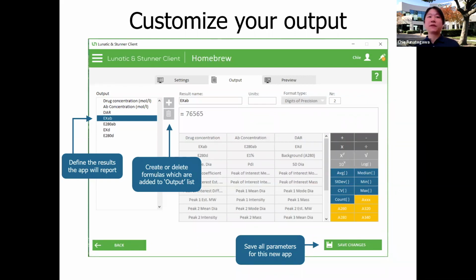So I have the extinction coefficient of the antibody at 280 and at 252. I have also the extinction coefficient of the drug at 252, which is where the absorbance maximum of the drug is, and also the absorbance of the drug at 280, so that we can subtract out those contributions. Again, this is just basing it off of that one equation that I showed you earlier.